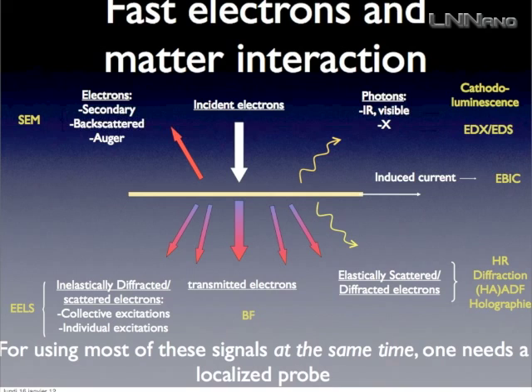So it can be infrared, it can be visible, and then it's coined as cathodoluminescence, and I will discuss a little bit about that during my seminar, and Louis Zagonel as well, or in the form of X-ray photons, and it's EDX, okay? And this is a little weird, cathodoluminescence, but EDX is very, very well known, especially in conjunction with STEM, for chemical analysis.